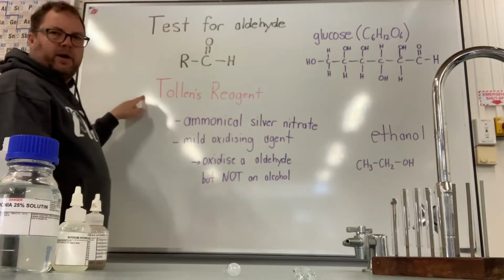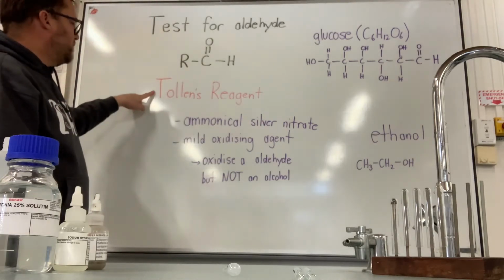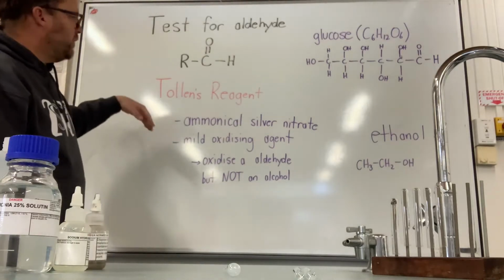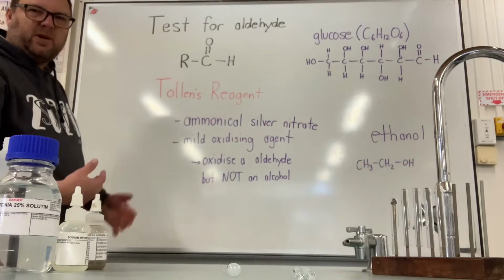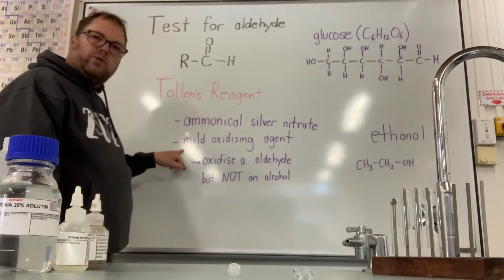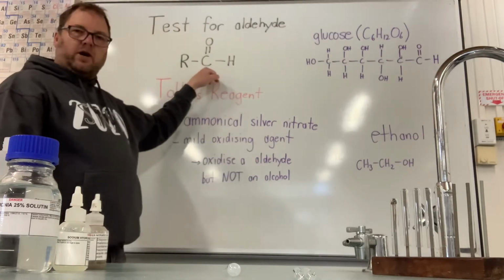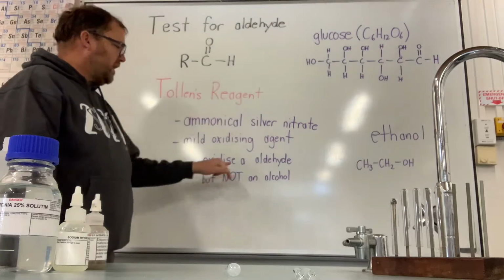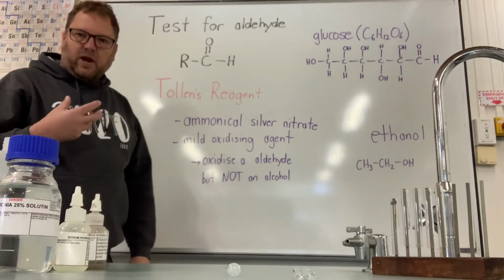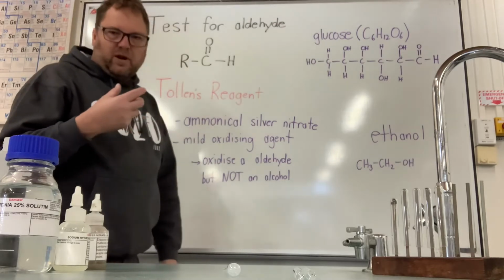So the reagent that we're going to use to test for an aldehyde is called Tollen's reagent. Tollen's reagent is also known as ammoniacal silver nitrate, but you really only need to remember Tollen's reagent, but you'll see where that name comes from when I make it up. And it's a mild oxidizing agent. This means it's able to oxidize an aldehyde, because an aldehyde is fairly easy to oxidize, but it can't oxidize an alcohol like the dichromate, which is another oxidizing agent that we use, and we'll also demonstrate in a separate video.